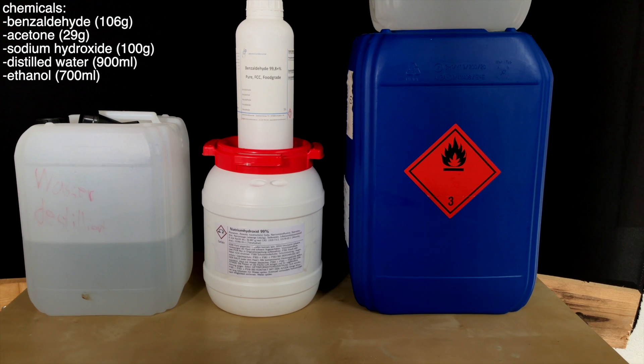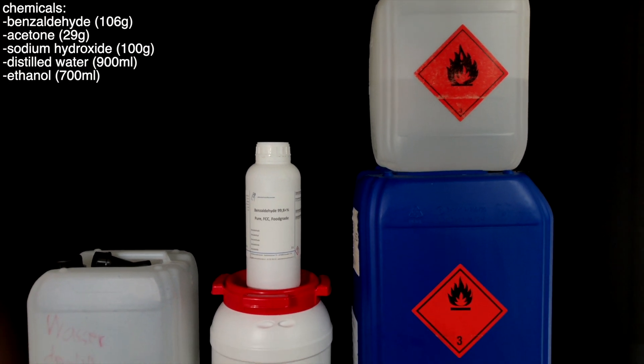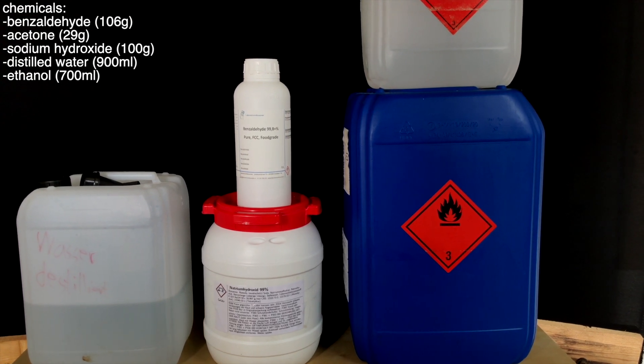To make this compound you will need 106 grams of benzaldehyde, 29 grams of acetone, 100 grams of sodium hydroxide, 900 milliliters of distilled water, and 700 milliliters of ethanol. If we wanted to do a recrystallization we would need more ethanol or ethyl acetate.